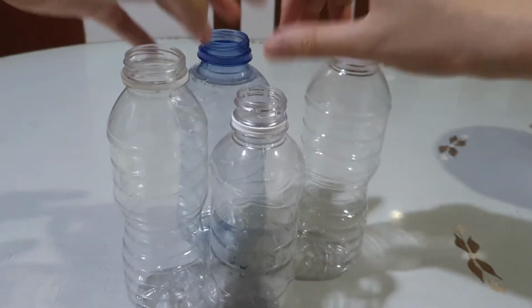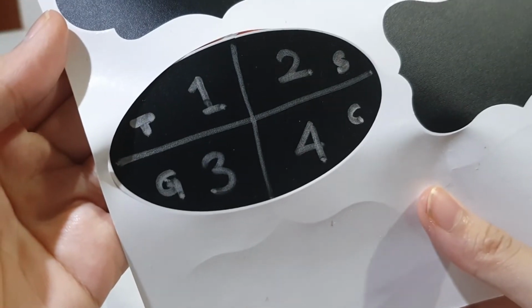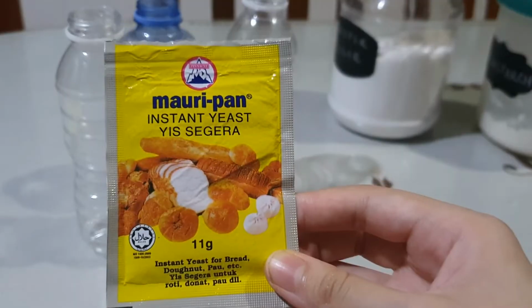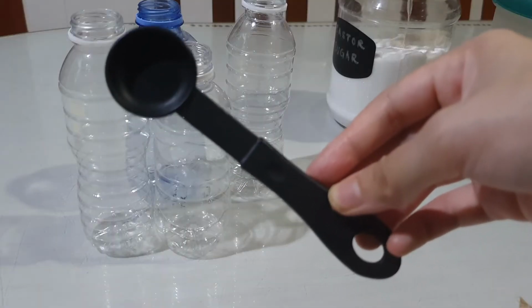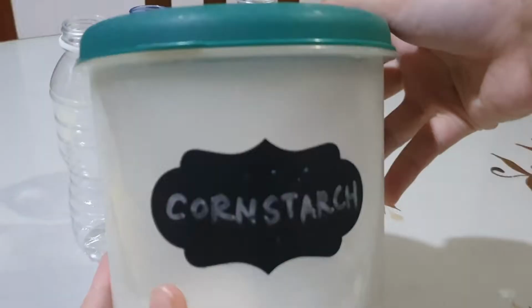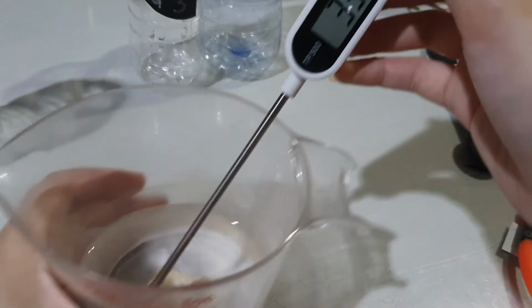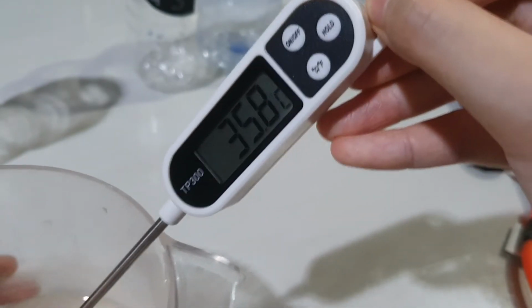The materials you're going to need are 4 plastic bottles, 4 stickers for labeling, a bunch of balloons, baker's yeast, a teaspoon measure, and the carbohydrate samples I'm using: table sugar, glucose syrup, and cornstarch. Lastly is warm water. The water needs to be warm, or at 37 degrees Celsius to be precise.